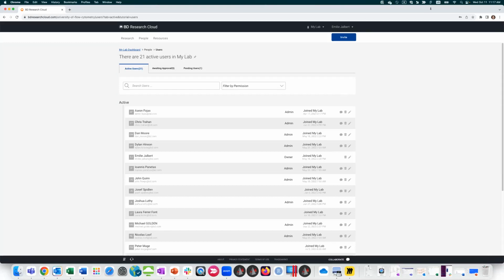So what will happen is when you invite them, you put their email address, they'll receive an email from BDRC saying, so-and-so wants to include you in their org, click here, and there's a link that will bring them to BD Research Cloud and they can sign up at that point. Good question.